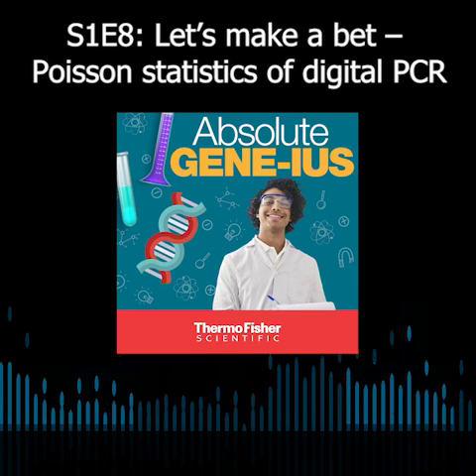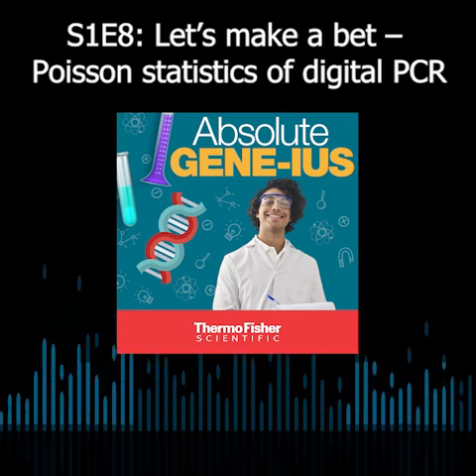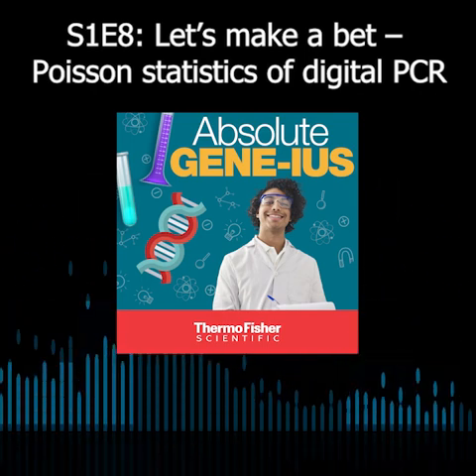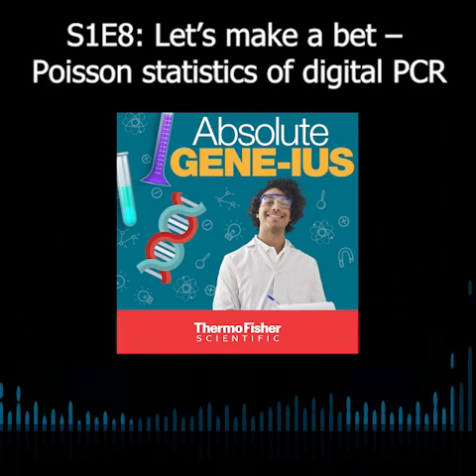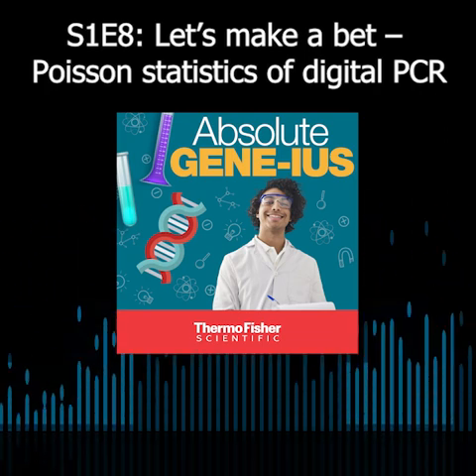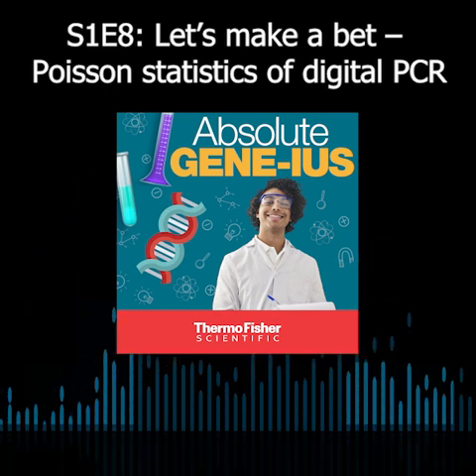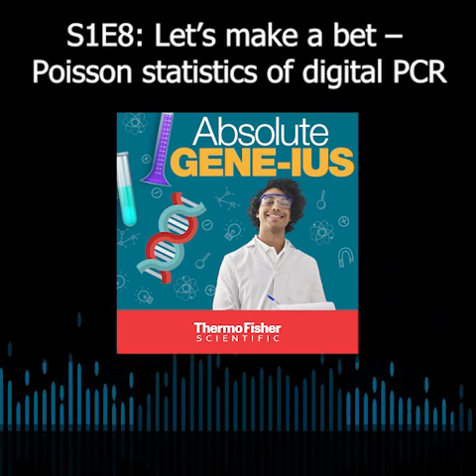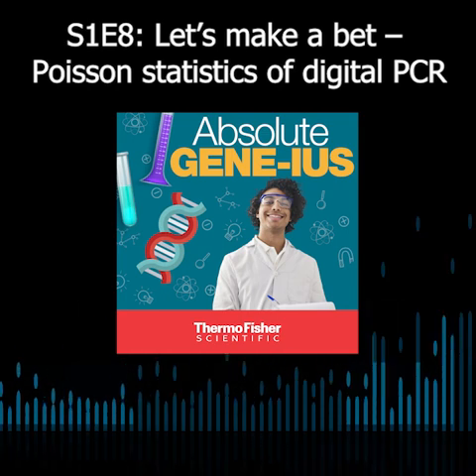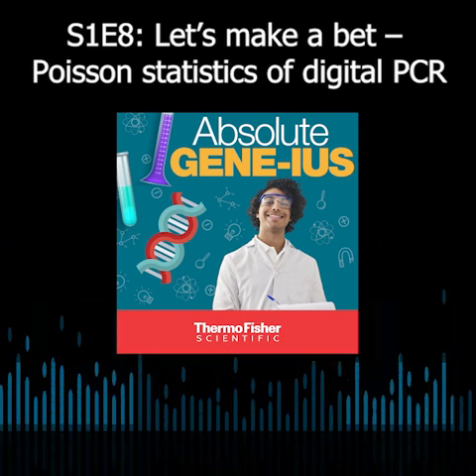With digital PCR, though, we take that reaction volume containing those thousands of DNA targets, and we're spreading them out into many, many mini reactions, or for our system, we call microchambers. But those mini reactions, they're so small that you actually expect some of them to not have any of your 5,000 targets in that example. And the whole idea of digital PCR is that some of those mini reactions that do have a target, they give you signal. The mini reactions that don't have any target don't give you a signal.